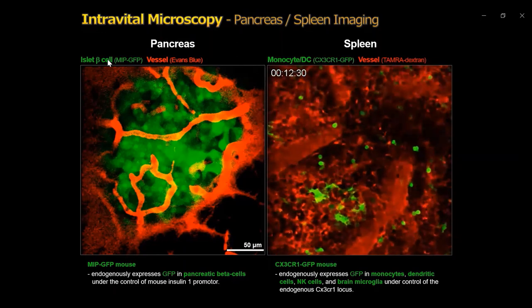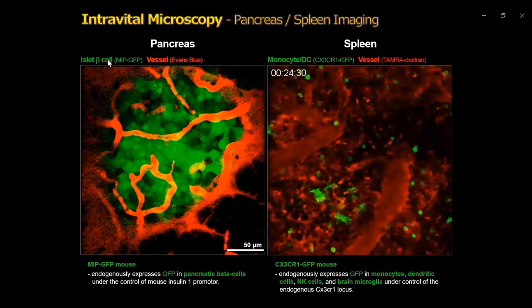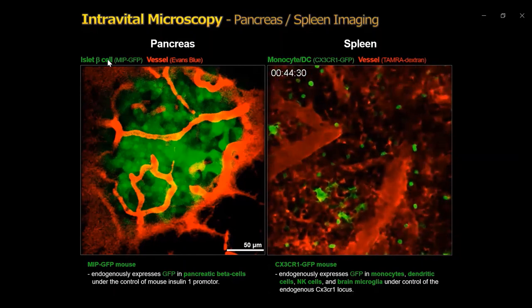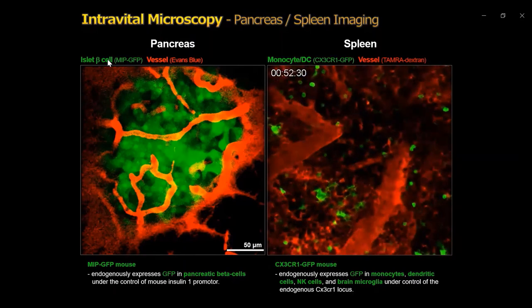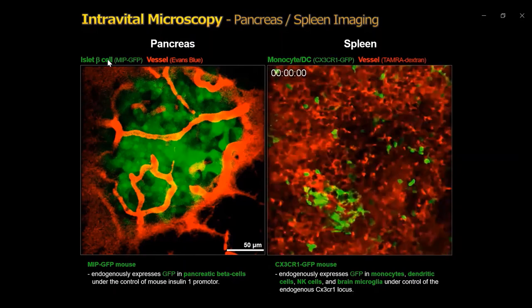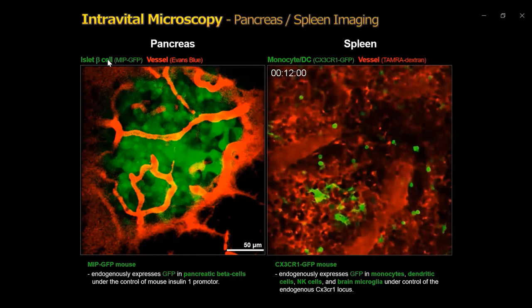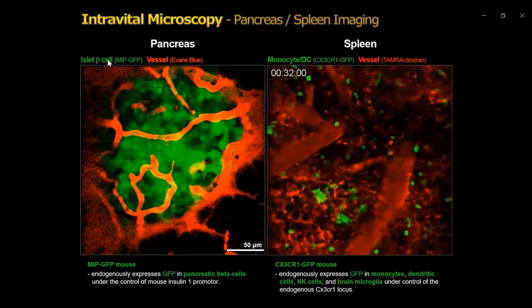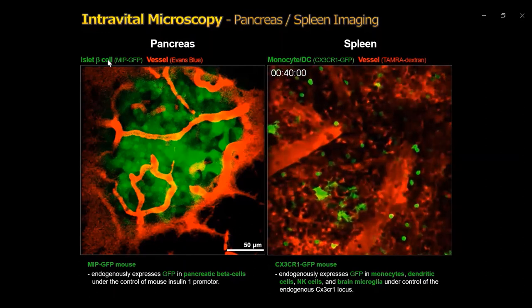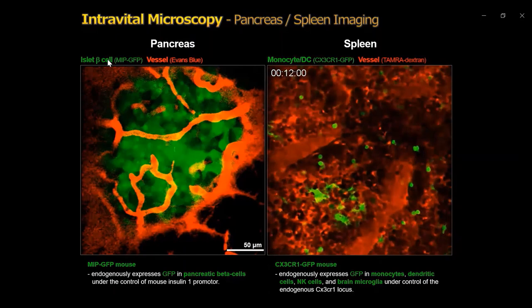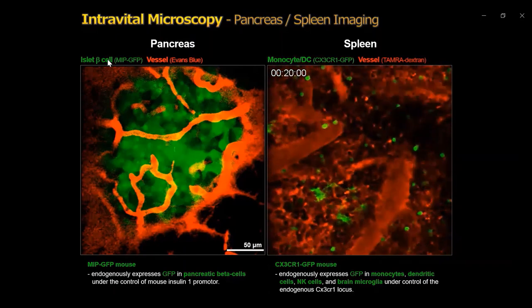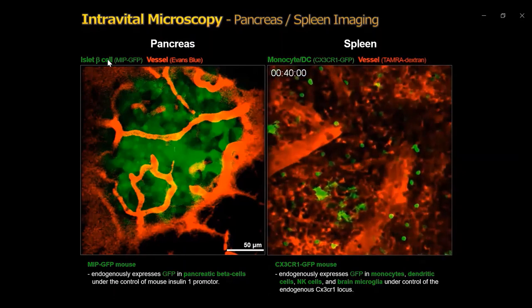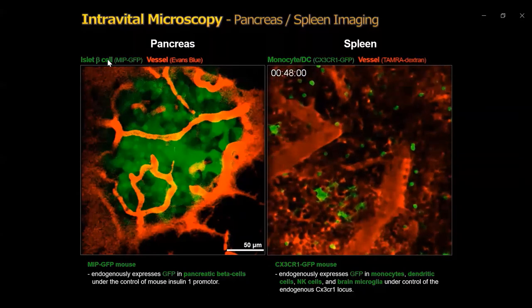We could visualize real-time cell dynamics of endogenous monocytes and dendritic cells in spleen imaging by using CX3CR1-GFP transgenic mice. This is also an example of pancreatic islet cell imaging using MIP-GFP transgenic mice — those islet beta cells in the pancreas were visualized in vivo and their cell dynamics and development were monitored on a long-term basis using the intravital abdominal imaging window, allowing real-time cell dynamics of islet beta cells.